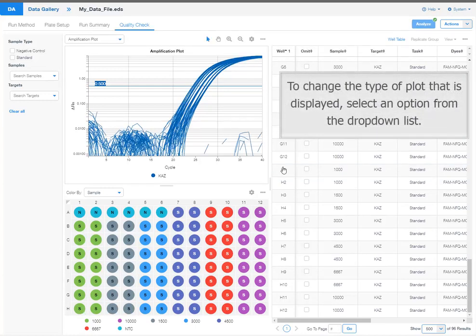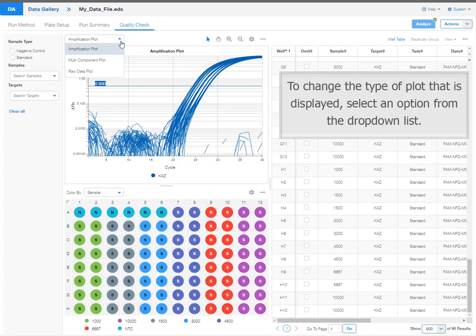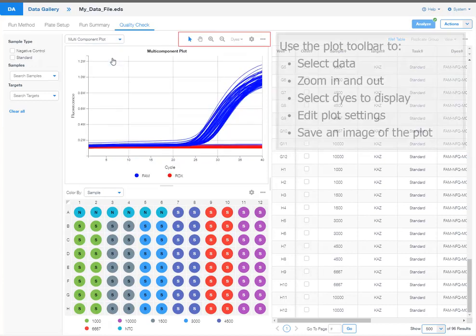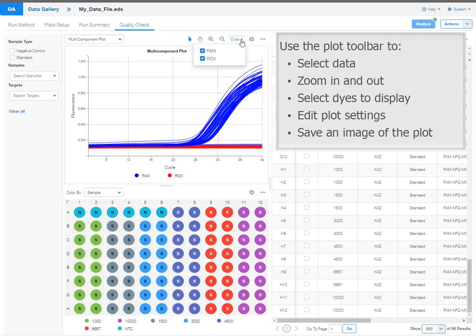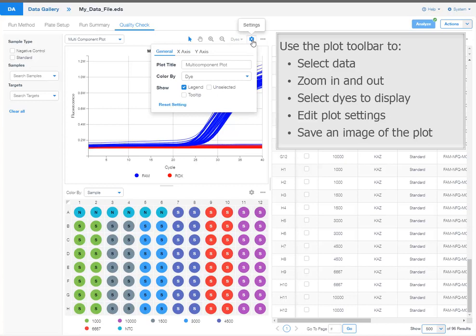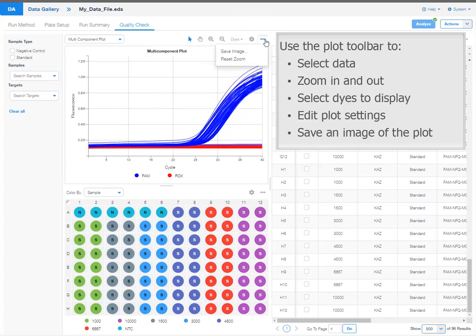To change the type of plot that is displayed, select an option from the drop down list. Use the plot toolbar to select data, zoom in and out, select dyes to display, edit plot settings, or save an image of the plot.